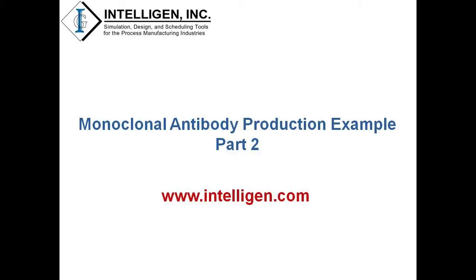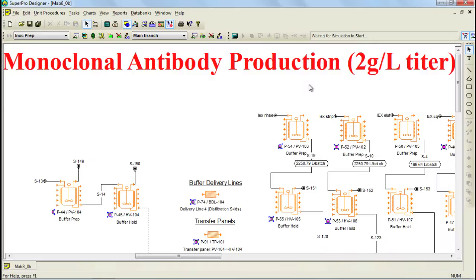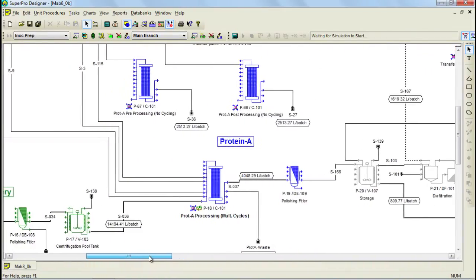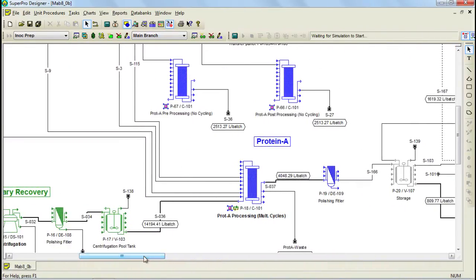If you still don't have a copy of SuperPro Designer, make sure to visit our website www.intelligen.com where you can download an evaluation version of the tool. Let's now continue this tutorial by discussing how to operate a unit procedure in cycles. As you may remember from part 1, all the chromatography columns applied in this model are operated in cycles. Operating the columns in cycles gives you the advantage of increasing the column time utilization while reducing the required size.